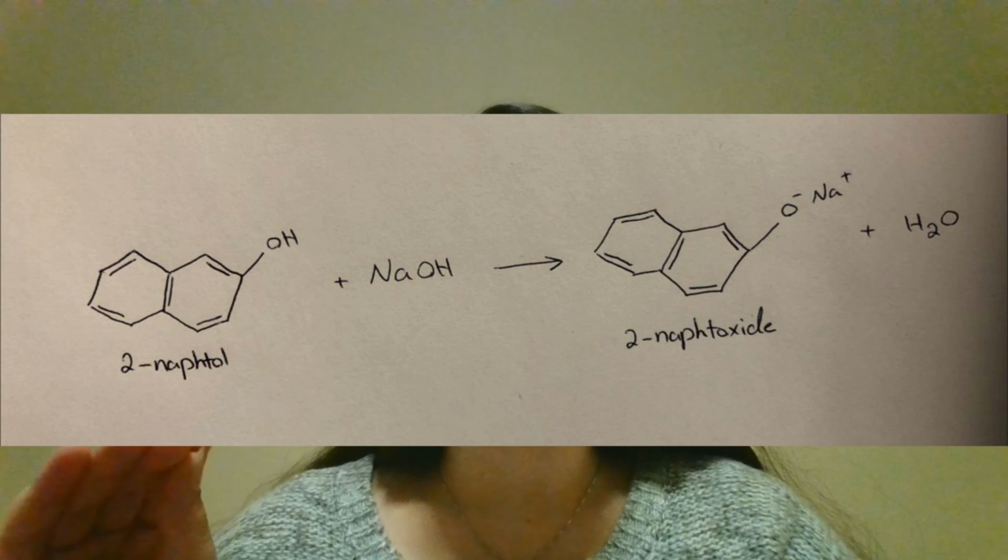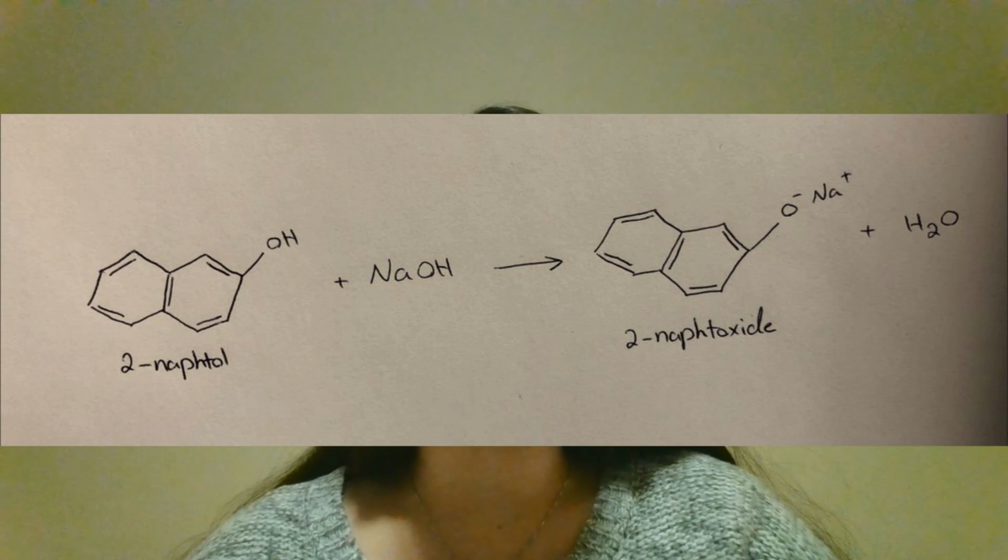And then at this stage, we will have a greenish brownish colored mixture, and then we can add a condenser on top of the flask and start boiling the compound. By doing so, the 2-naphthol will react with NaOH, and the proton transfers from 2-naphthol to the hydroxide ion and produces 2-naphthoxide, which is the conjugate base of 2-naphthol, and it also produces water. The condenser in this experiment prevents the solution from drying out, and also ethanol has a role as a solvent in this experiment.